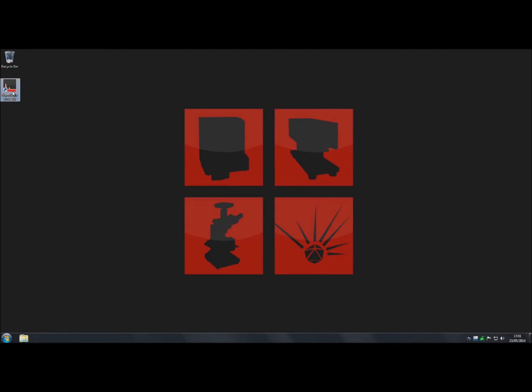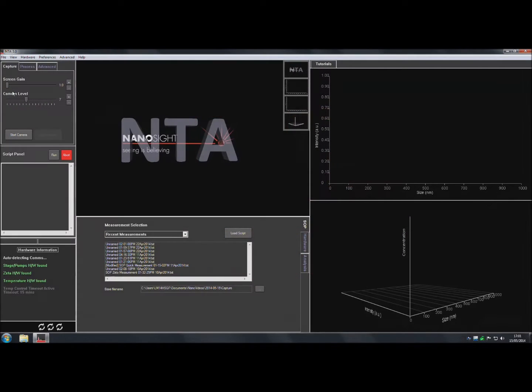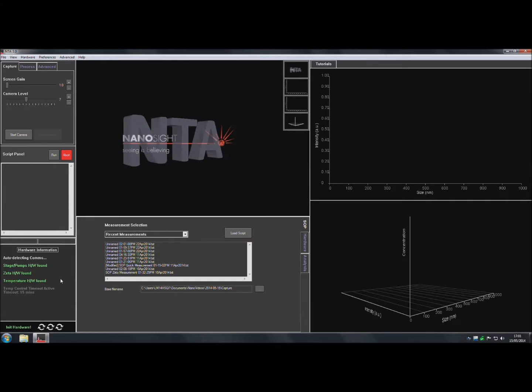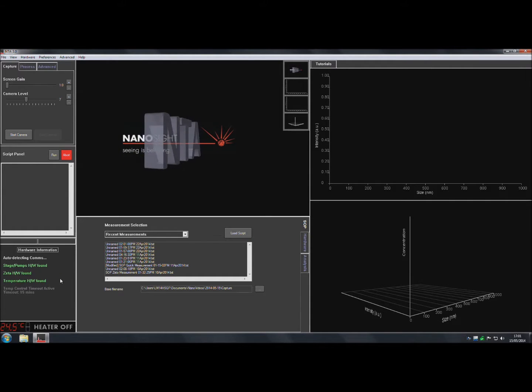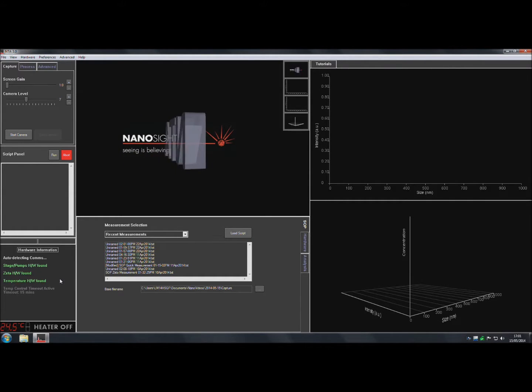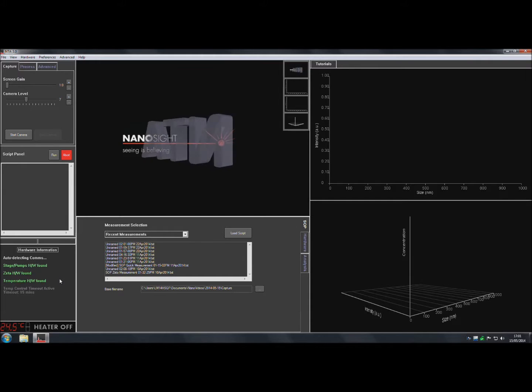Double click on the software icon to open the NTA home screen. The software will automatically detect any hardware that is connected to the instrument and the connection status will be shown at the bottom left.